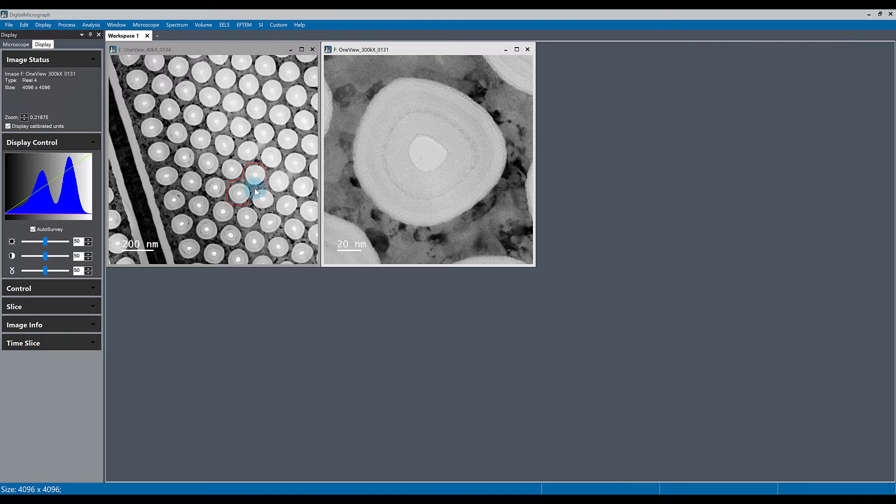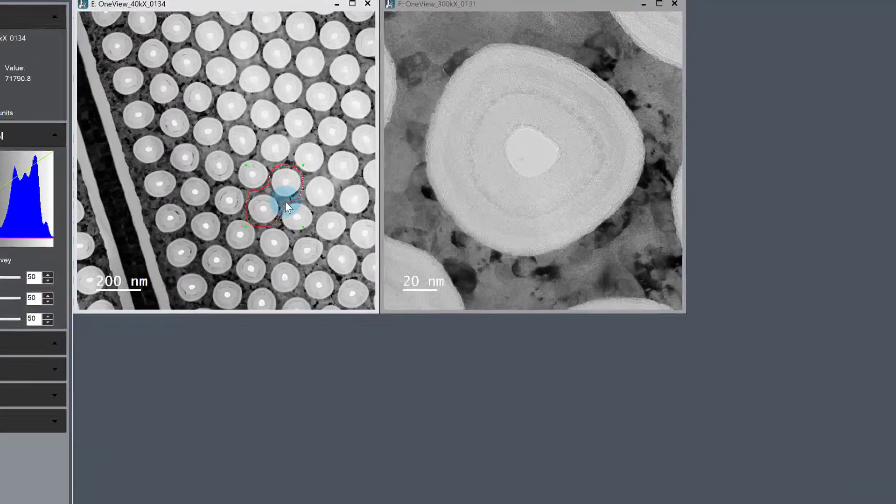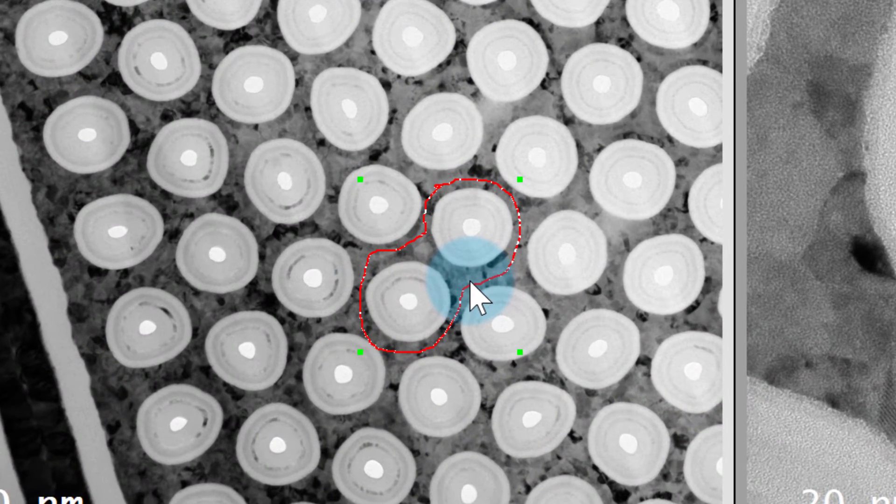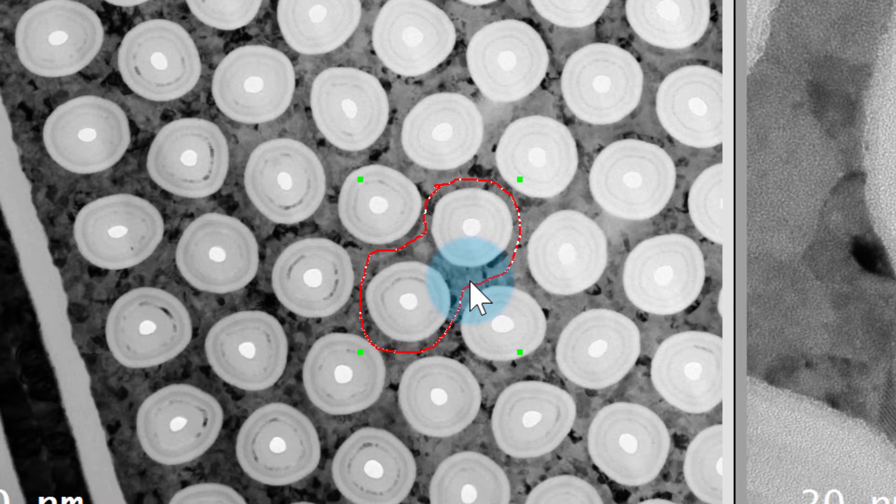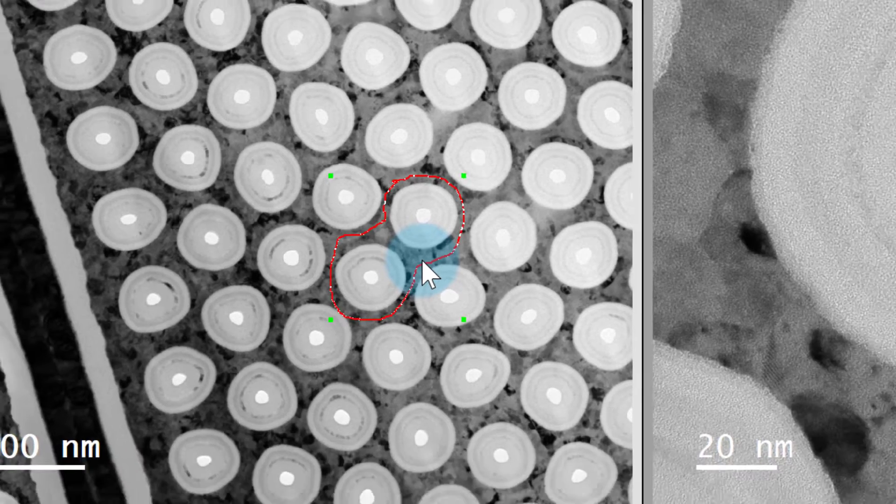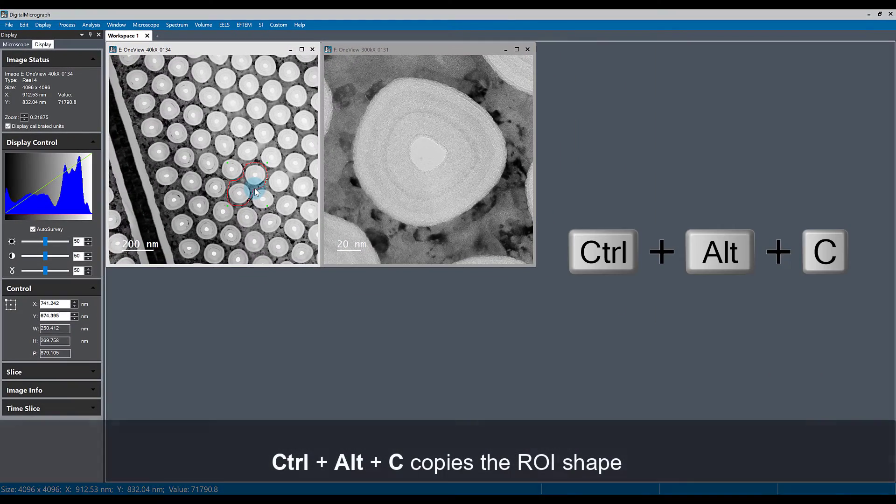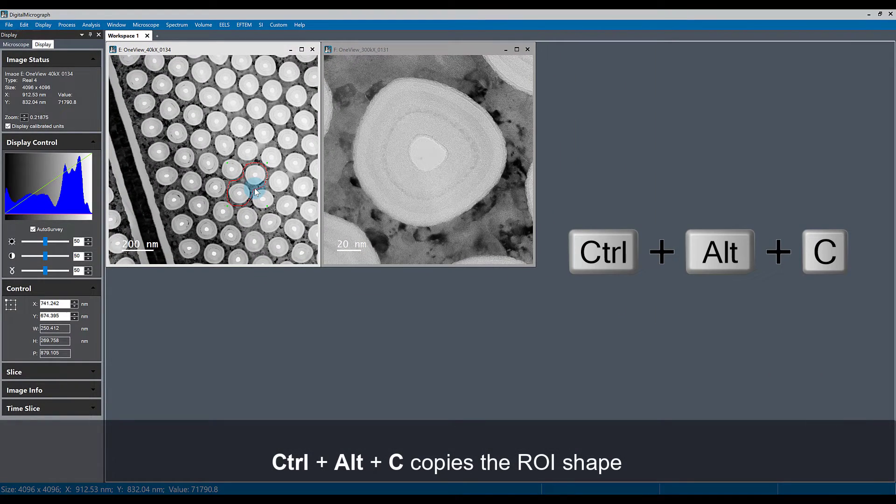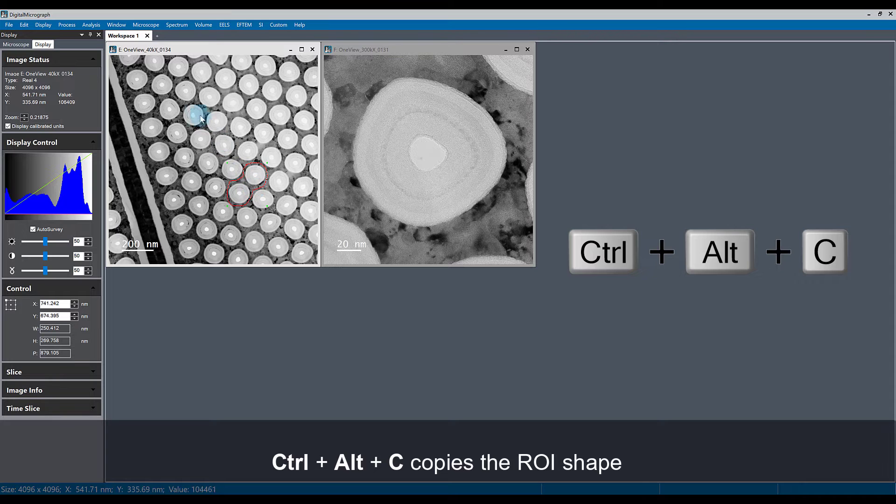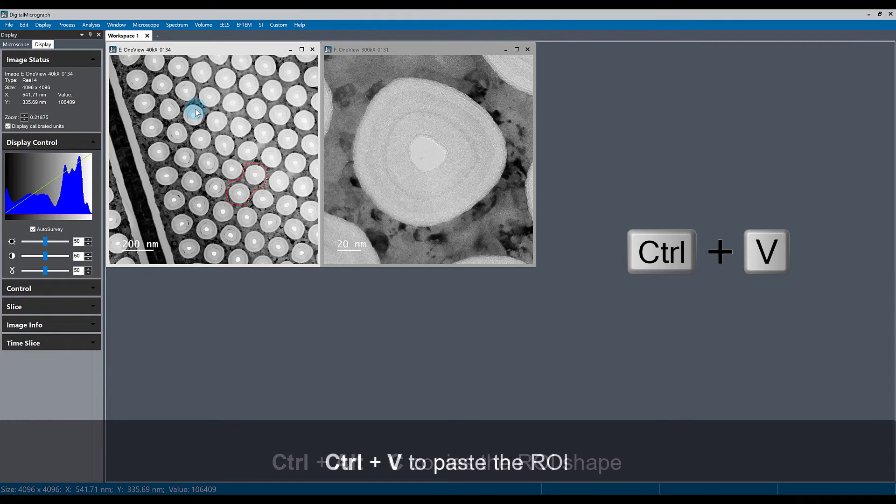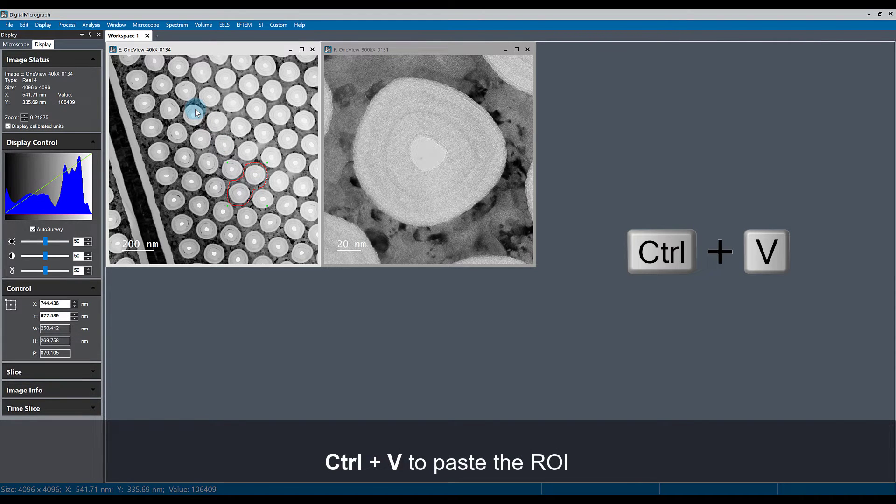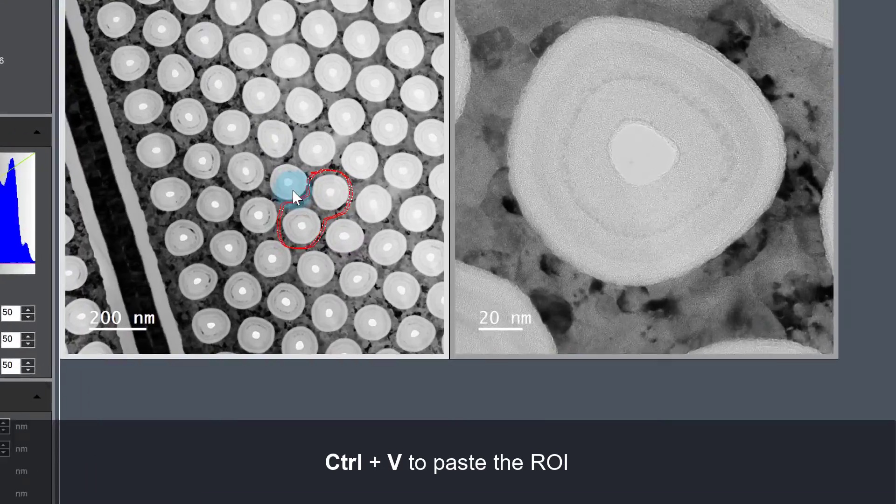For example, in this image on the left, we've generated this unique loop shape ROI. If I hold Ctrl-Alt-C, I can actually copy the ROI shape and then use Ctrl-V to paste it into the image again.